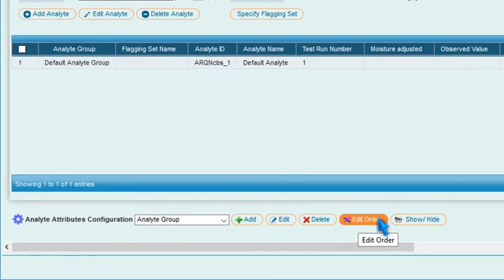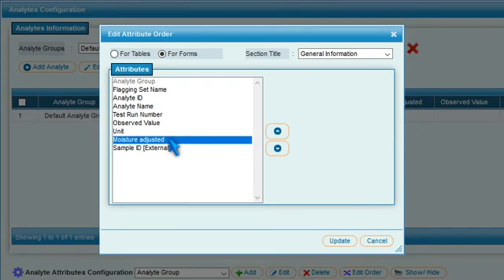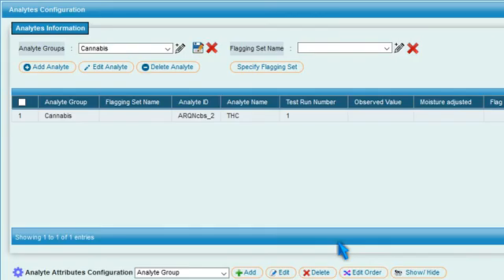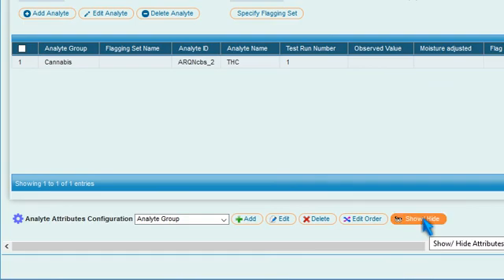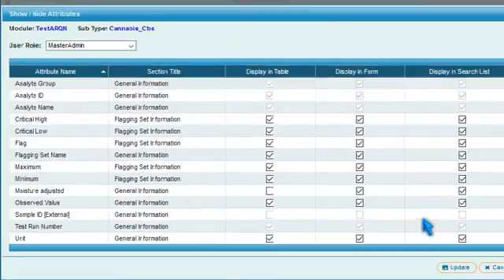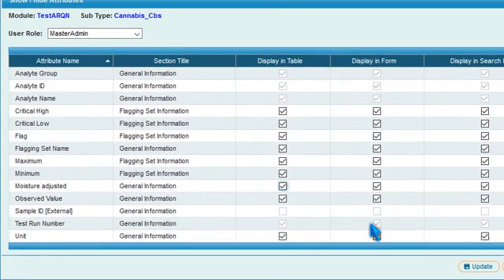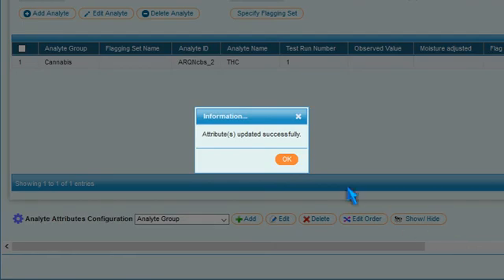Press Edit Order to arrange the order of the attributes in the form and in the table. To selectively display or hide analyte attributes in the table, form or search list, press Show slash Hide. Tick the corresponding boxes and press Update to finalize the selection.